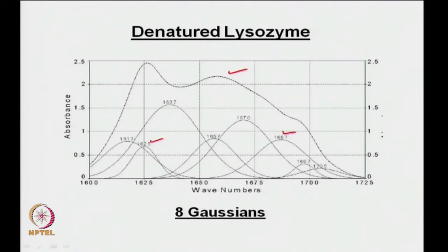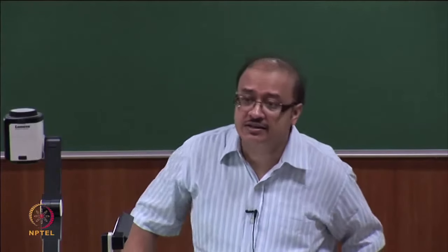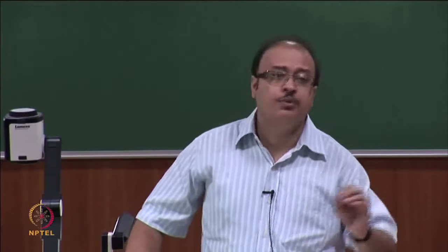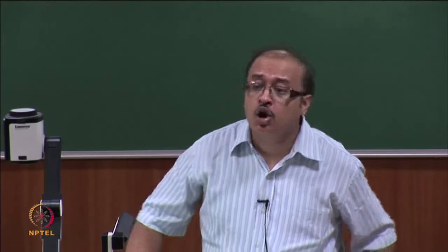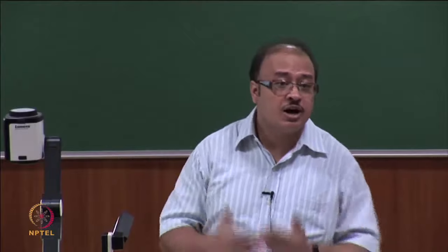Okay. Now, is this all what it is? No, many side chains also contribute, but we would not be going into that much detail. At the end of my discussion on IR spectroscopy, I will give you some references. I think these references are extremely useful for anybody working on IR spectra of proteins, for them to have a logical interpretation, a logical insight of what we can have under the experimental band shape.